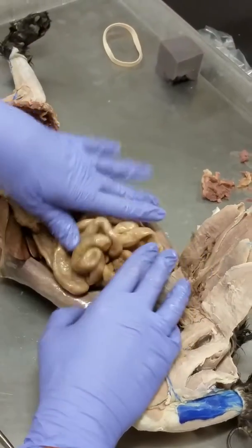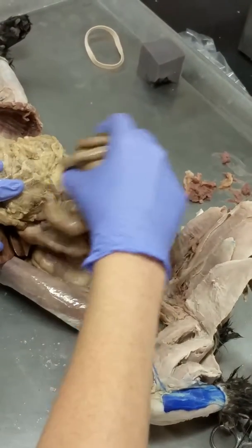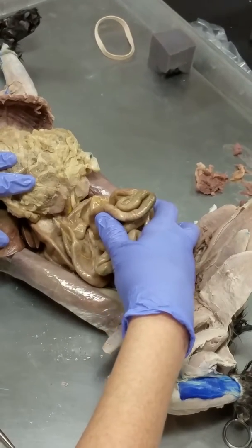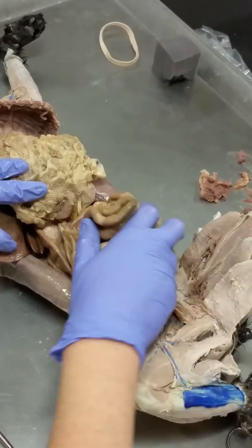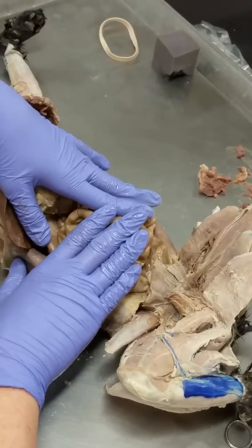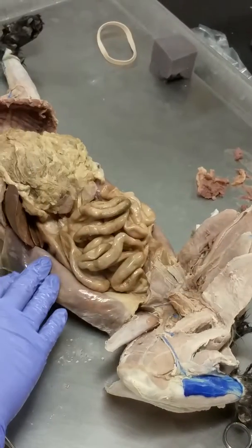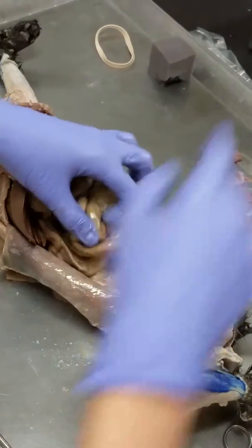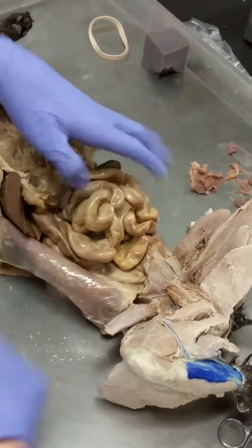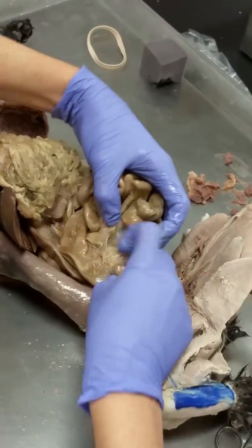The difference between, so all of this is jejunum and ileum, all of this glob that I'm grabbing here. There's no clear-cut boundary between the two of these, okay? Jejunum is the part of the small intestine that's in the middle. It goes duodenum, then a bunch of jejunum, and then it's ileum. Ileum is the part that connects to our large intestine.